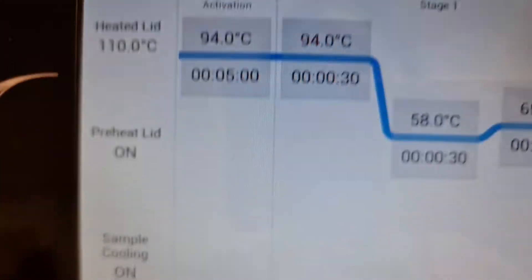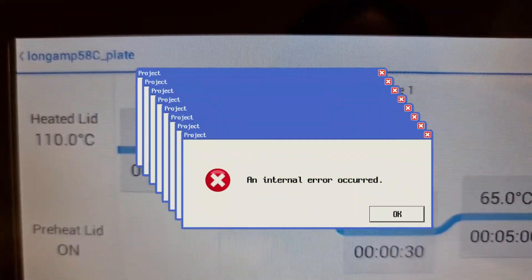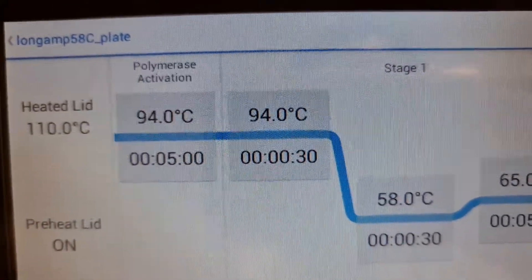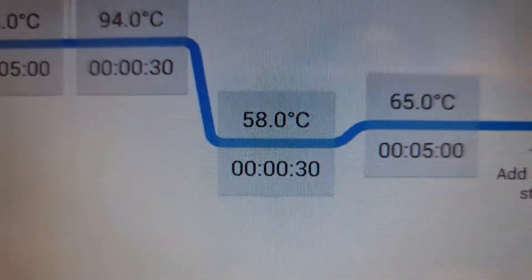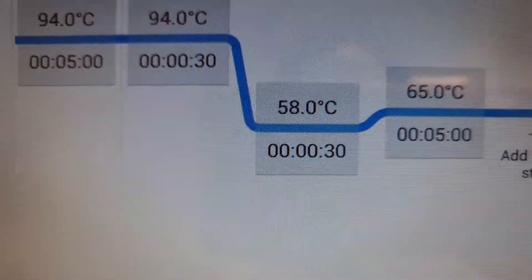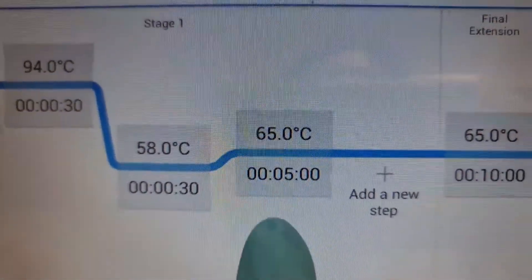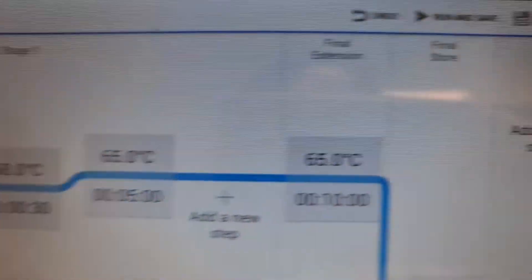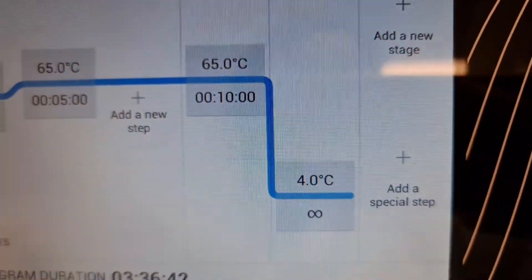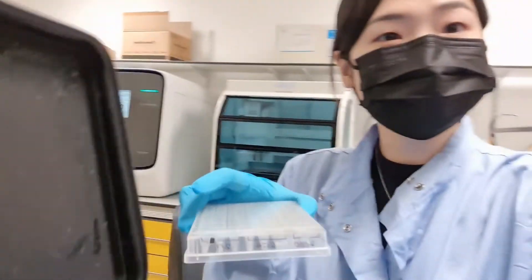During a PCR reaction there are several steps. The first is polymerase activation. Then we denature our DNA double strand at a really high temperature. Then there's the annealing step, where the primers bind to the single-stranded DNA, followed by the extension step — the time for extension depends on your expected amplicon size. Then a final extension, and it will be stored at 4 degrees. It's going to take a total of 3 hours and 36 minutes.